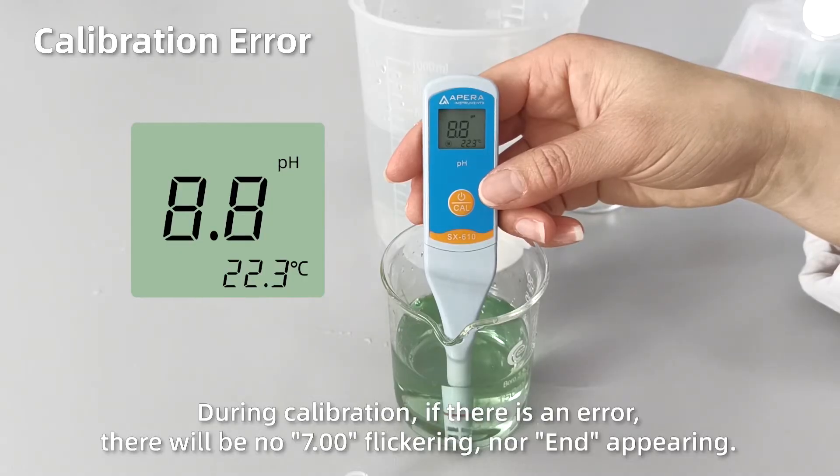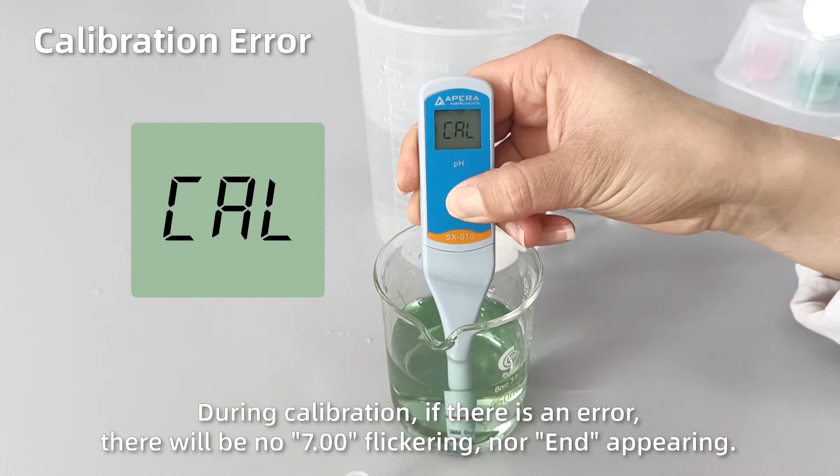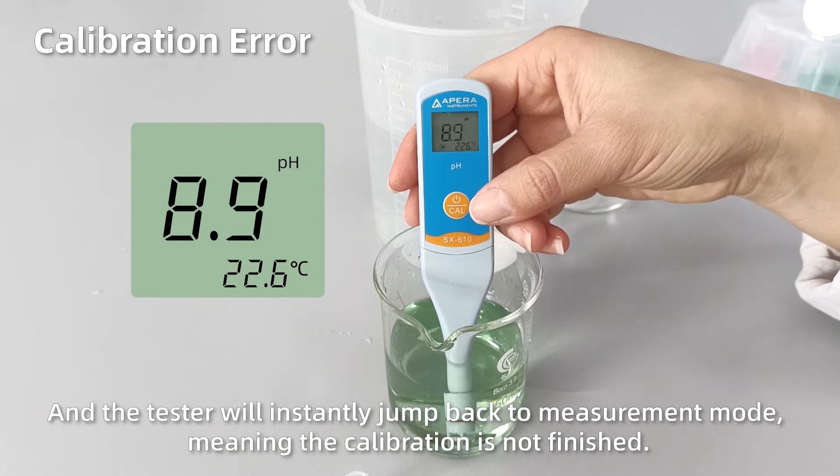During calibration, if there is an error, there will be no 7.00 flickering, nor 'end' appearing, and the tester will instantly jump back to measurement mode, meaning the calibration is not finished.